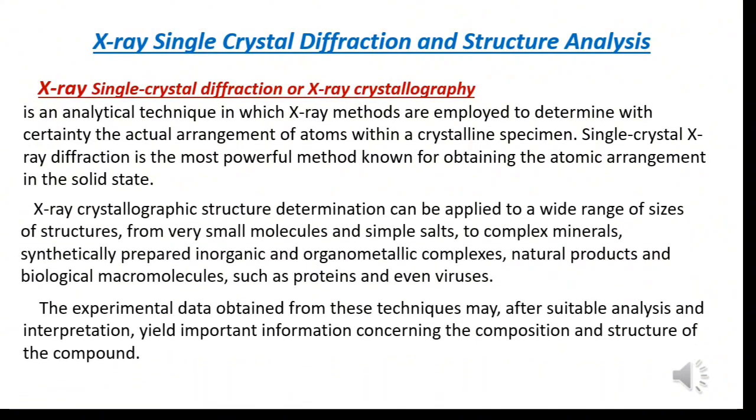Single crystal X-ray diffraction and structure analysis. Single crystal X-ray diffraction, or X-ray crystallography, is an analytical technique in which X-ray methods are employed to determine with certainty the actual arrangement of atoms within a crystalline specimen. Single crystal X-ray diffraction is the most powerful method known for obtaining the atomic arrangement in the solid state.